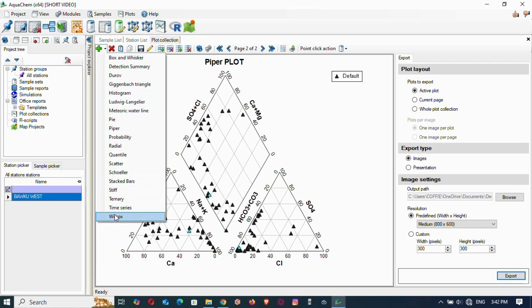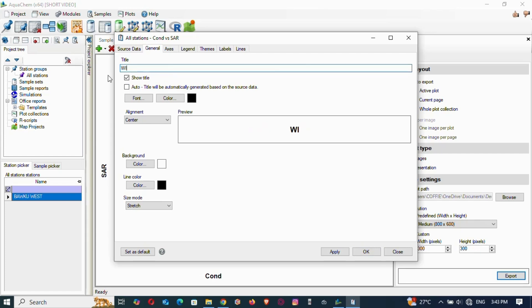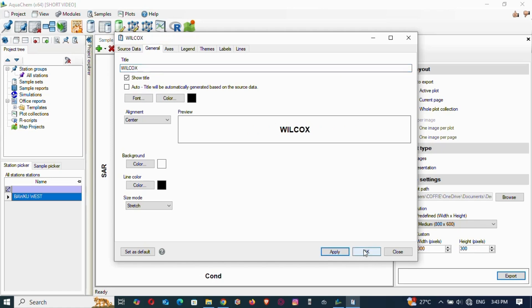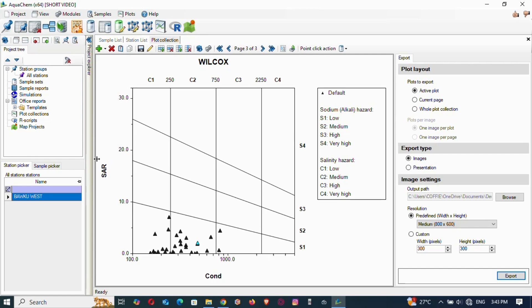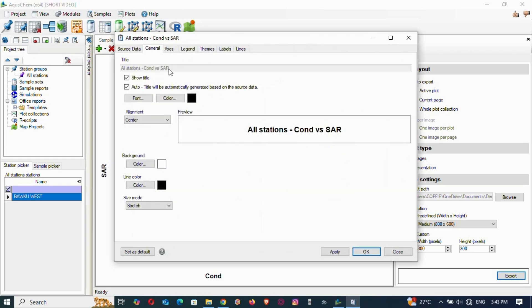Now let's look at how to do the Wilcox diagram. Select Wilcox and it will appear. Give it a name, deselect auto title, give it a name, apply, then OK. Note: it's plotting SAR against conductivity — when you plot SAR against conductivity, that is NOT Wilcox, it is the USSL diagram. So change the title so you don't get confused.